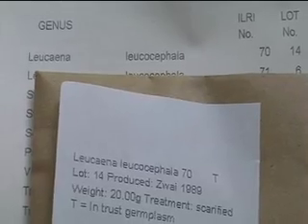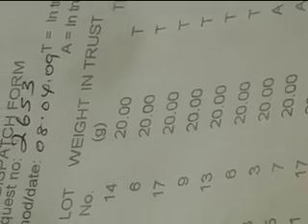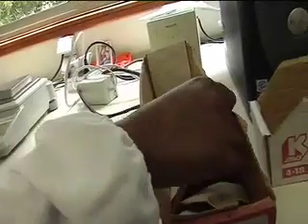Labels with all relevant information should be printed, mentioning the name of the species, the accession number, the location and date of production, and the total weight and the type of germplasm. The dispatch list is prepared, and passport data for each accession is printed out to accompany the seeds.